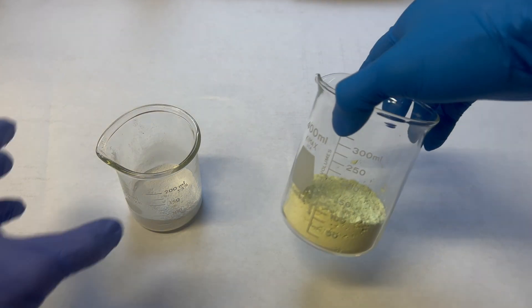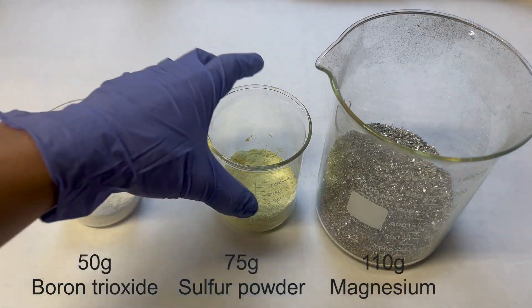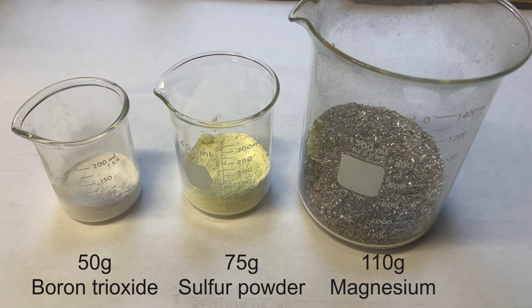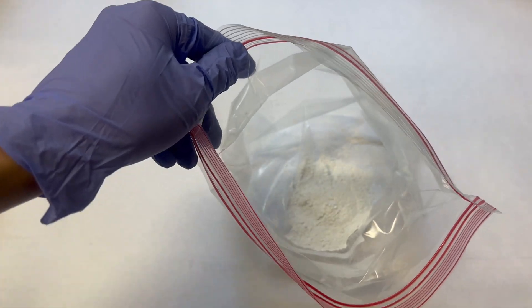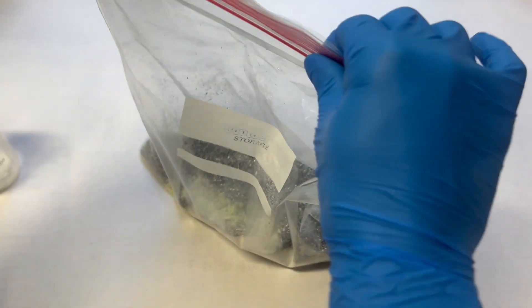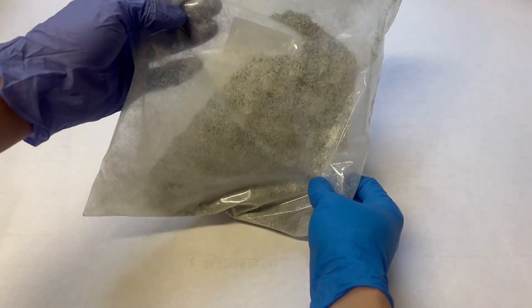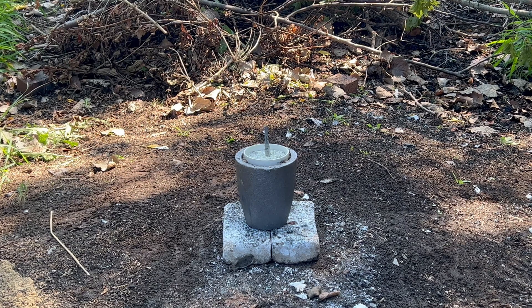The magnesium reduces the boron trioxide to boron. I want a high reaction temperature, so sulfur was added to the mix to add heat to the reaction. I mixed 110 grams of magnesium with 50 grams of boron trioxide and 75 grams of sulfur powder. I used the bag method to make sure all parts were thoroughly mixed. The charge is then loaded into a crucible.